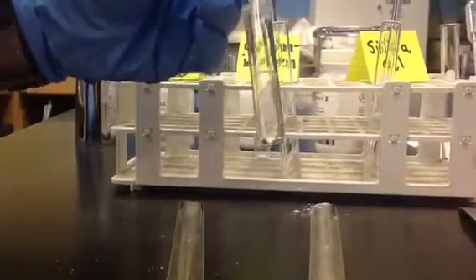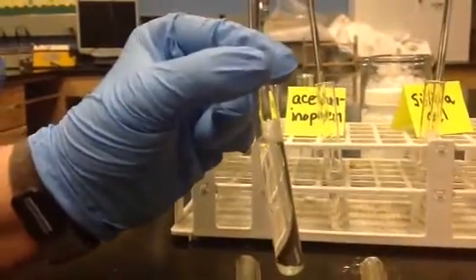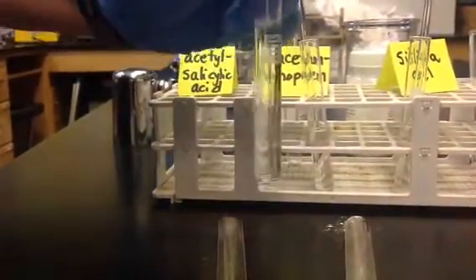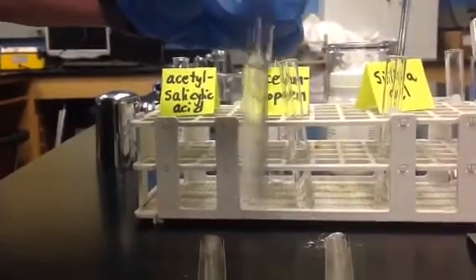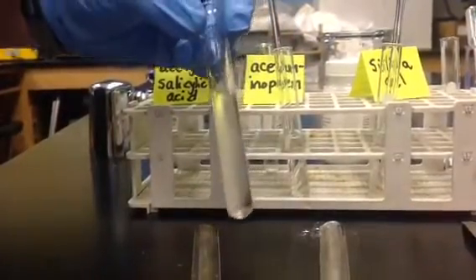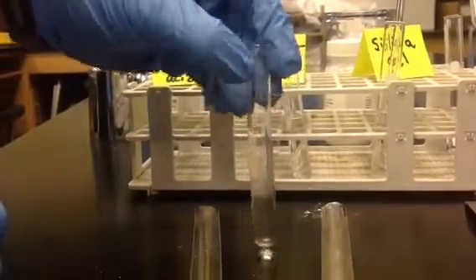Nope, I don't see any solid forming, but can you see the two different layers? They're not mixing. So water and ethyl acetate are what we call immiscible. They don't dissolve. They don't mix. You need to determine which one is more dense.